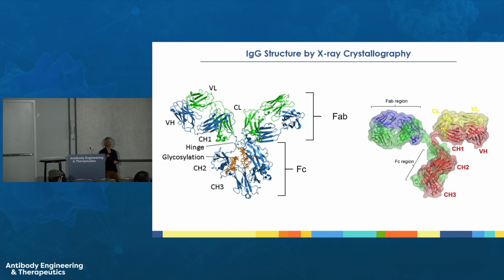So we thought, okay, antibodies function by molecular recognition. So why not develop analytical technologies based on molecular recognition? They would tell you a lot about the 3D structure of the molecule, and they could be informative too.